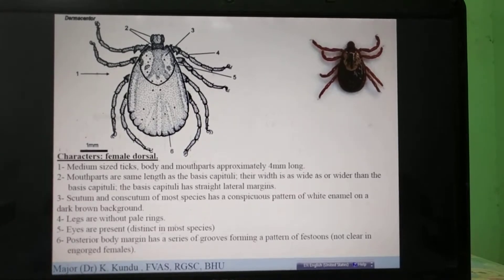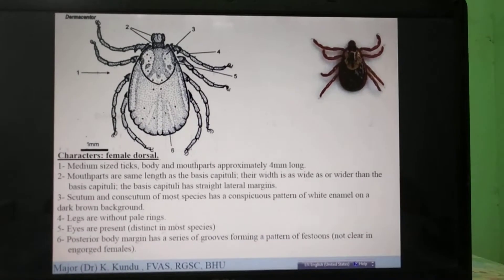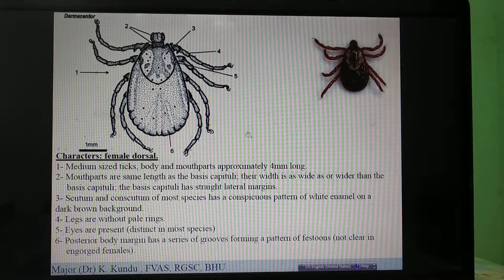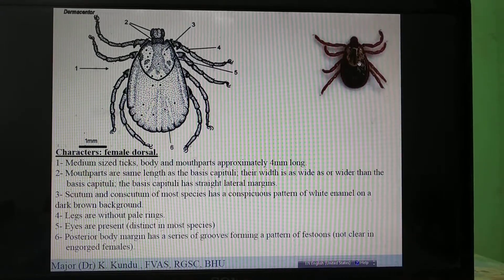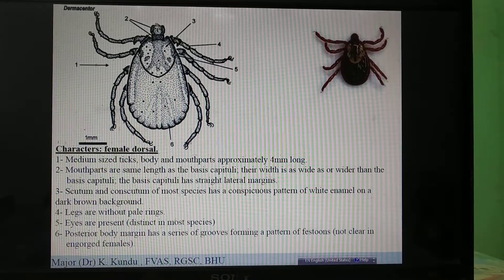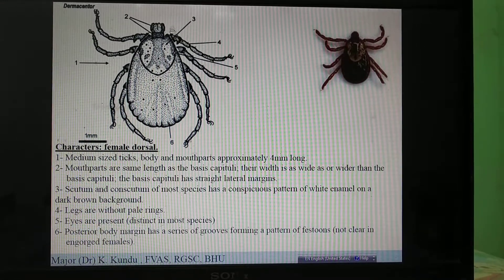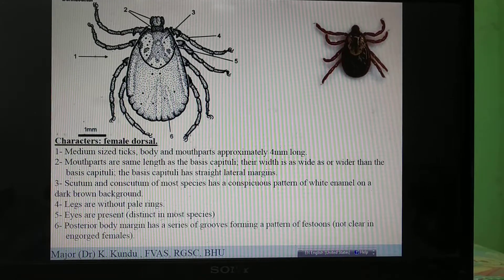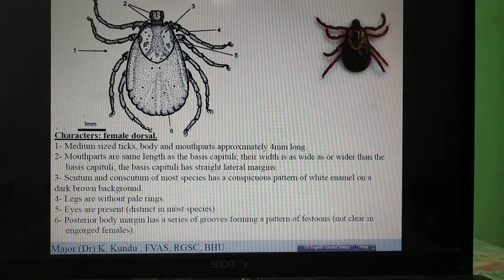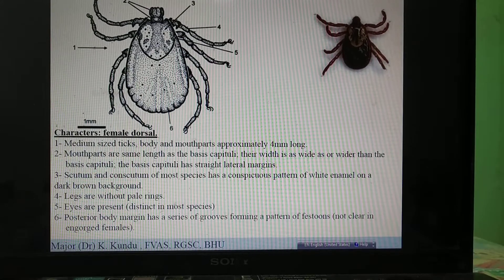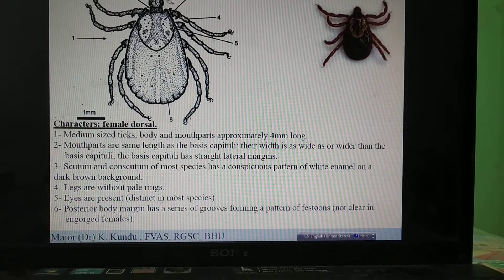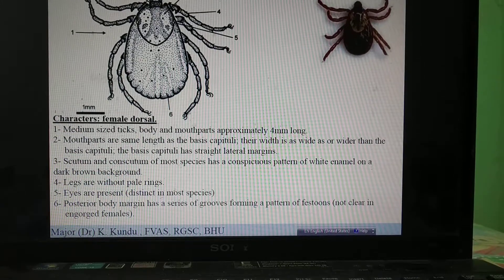The three remaining genera are Dermacentor, Ixodes, and Haemophysalis. Coming to Dermacentor — they are also a group of ornate ticks. How will you differentiate between Dermacentor and Amblyomma? Both are ornate, but the most important thing is the mouth parts. Amblyomma is longirostrate whereas Dermacentor is brevirostrate.